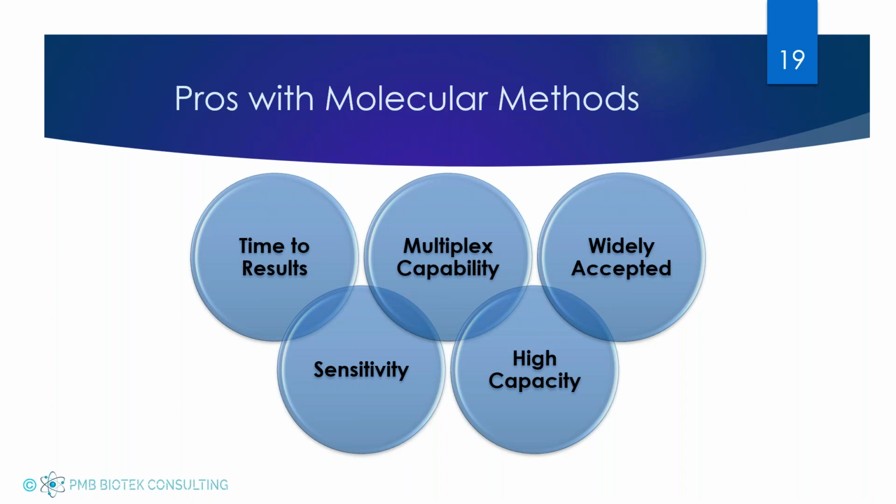Sensitivity, when we're talking about Salmonella, there's wide diversity. As I showed you those organisms earlier on the agar plates, that doesn't impact PCR. If Salmonella is there, they have targeted gene sequences, whether it's typical or atypical morphology on a plate, it will detect them, and it discriminates them from that Klebsiella. So you reduce some of that ambiguity that your technicians could have when reading a plate.